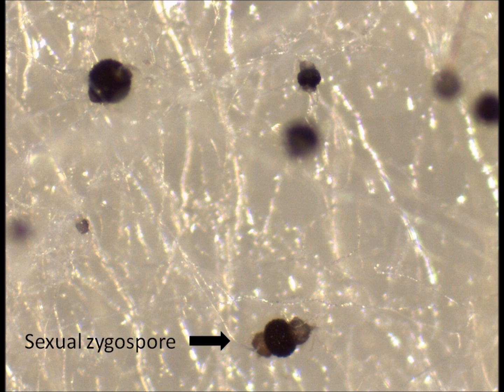So now we can look at a couple of shots taken using the stereo microscope to show you the two different types of spores. First, the sexual spores. You should be able to see the spore, the black round shape in the middle, and then on either side the swollen hyphae. That's very typical of the sexual spore.